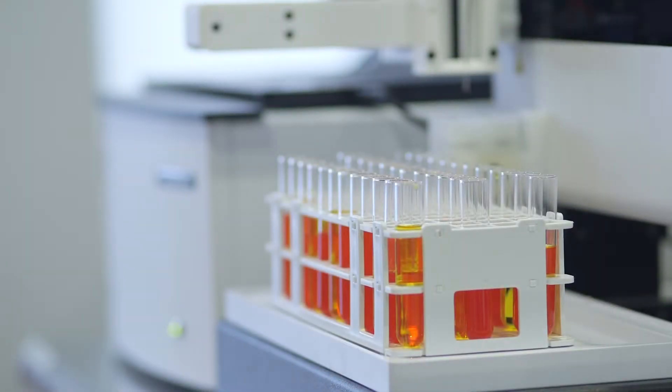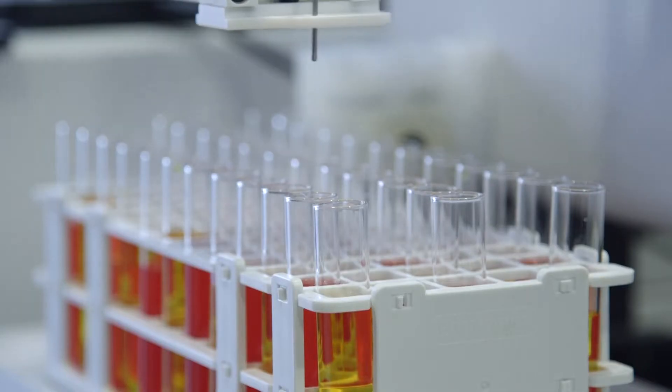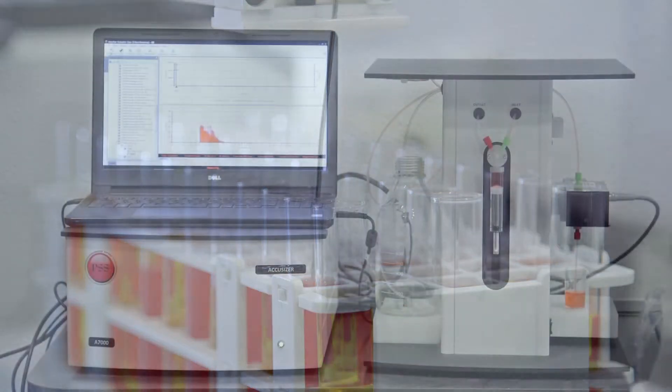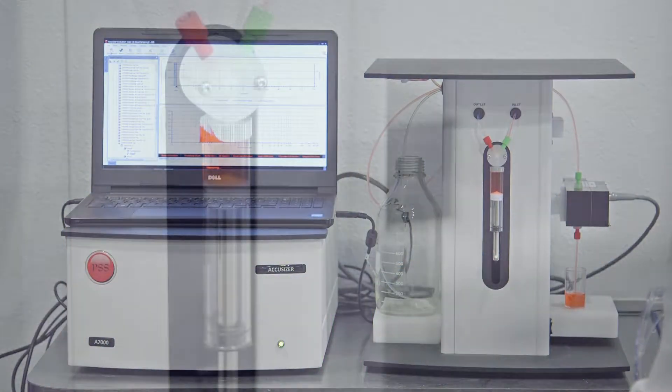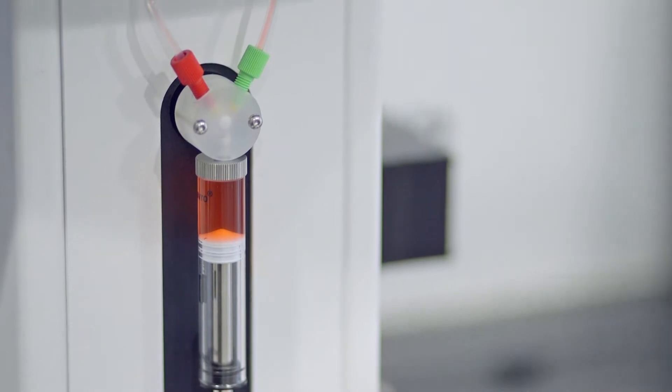Transporting the sample through the sensor is accomplished in the lab with the use of an automated sampler. The AccuSizer SIS aspirates low-volume samples through the sensor without dilution.